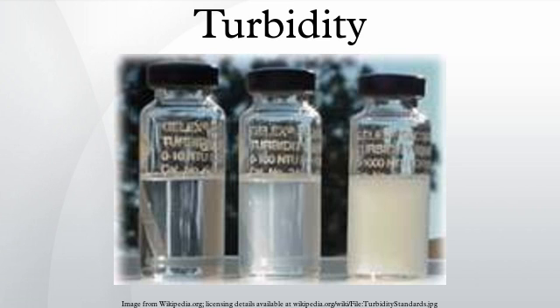It can provide a rough indication of the depth of the euphotic zone with a threefold division of the Secchi depth. However, this cannot be used in shallow waters where the disk can still be seen on the bottom. An additional device, which may help measuring turbidity in shallow waters, is the turbidity tube. The turbidity tube condenses water in a graded tube, which allows determination of turbidity based on a contrast disk in its bottom, being analogous to the Secchi disk.